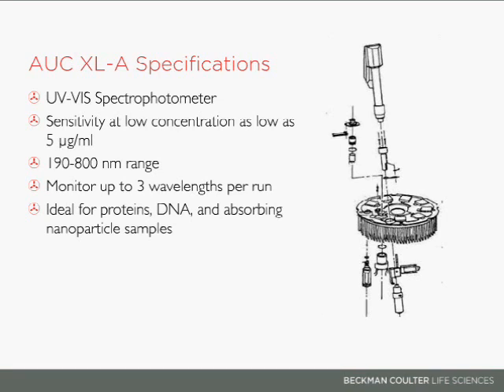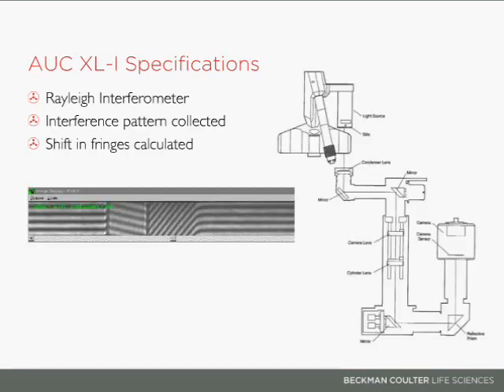It's somewhat like Young's double-slit experiment, where the difference in refractive index causes an interference pattern that shifts as the refractive index shifts with particle concentration. This interference pattern is seen on the detector, and by counting the shift in fringes per radius, you can directly calculate the concentration of the particles in solution.